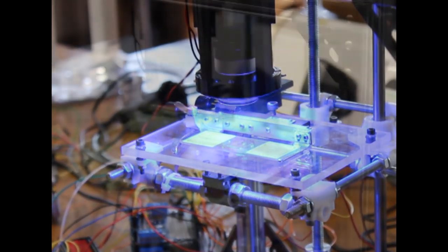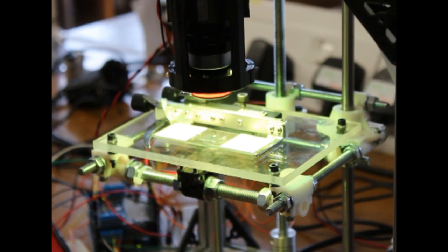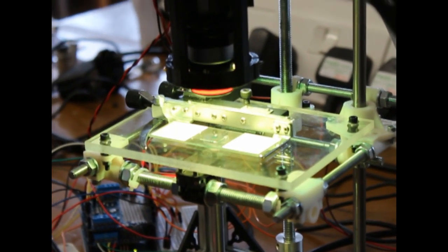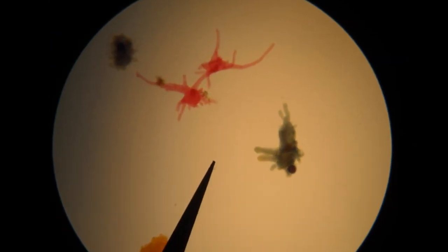And the other thing I've been doing is working with illumination. So it's very important how you light what you're looking at. That's one of the big challenges: how do you cheaply, using LEDs, get really good lighting quality so that you can get a really good image.